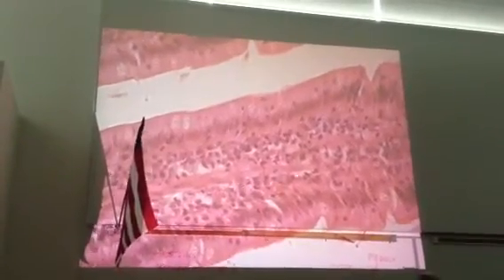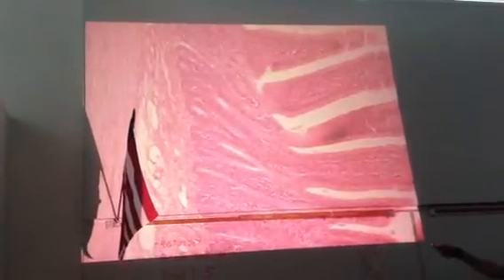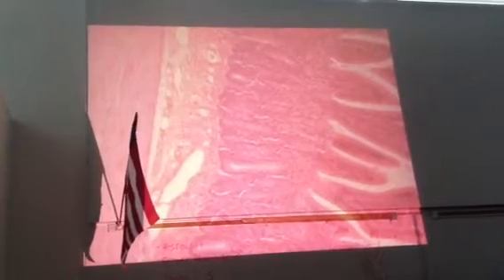Lamina propria is to the center. We're not going to try to identify anything specific there. The villus ends here, but then we've got these intestinal crypts. We backed off a little bit here so we can see that. So the intestinal crypts are still going to be a simple columnar epithelium. It just increases surface area for absorption. And the intestinal crypts are between every villus.